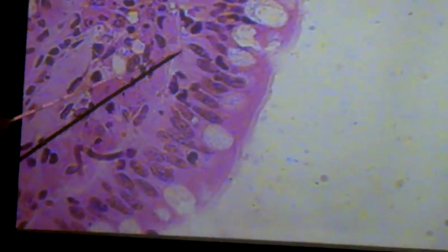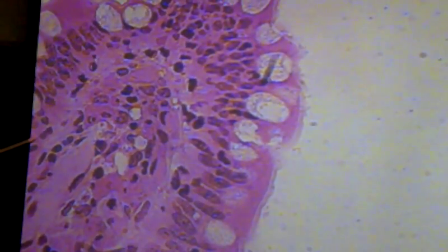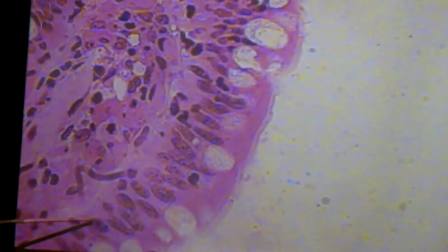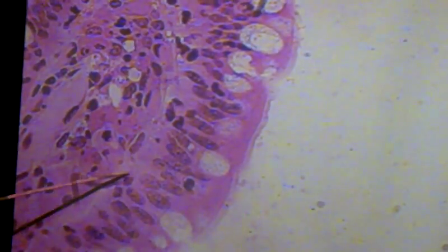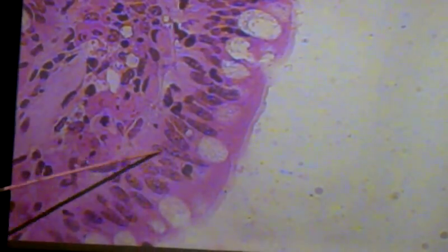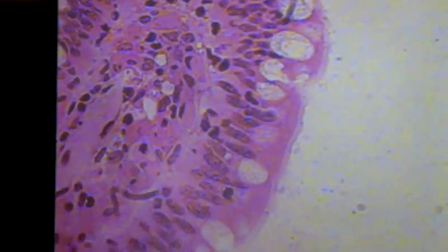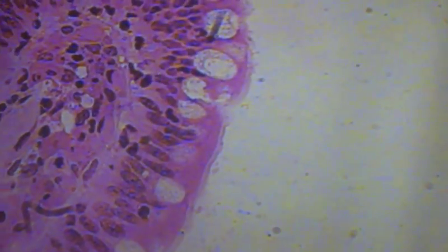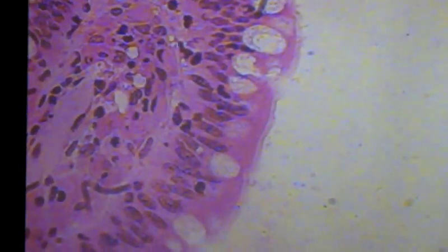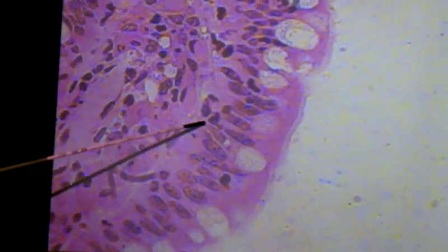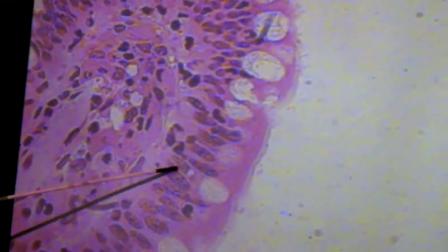Right here is the basement membrane of the epithelium. Around through here the epithelium is particularly good — we can see the nuclei, and we can imagine the cell membranes running in this direction. The cells are taller than they are wide, so they're columnar. You see these things right here — these are little droplets of mucus being secreted by specialized cells called goblet cells. The goblet cell actually sits below the mucus droplet, so this is probably a goblet cell right here.